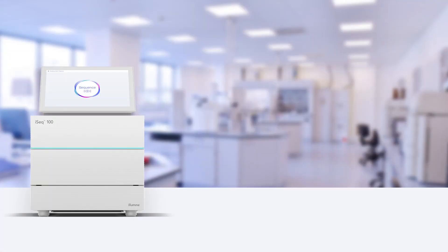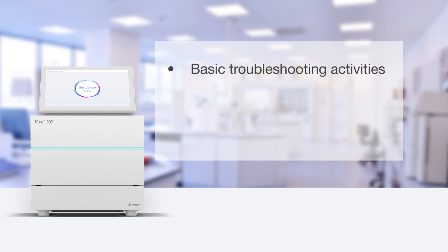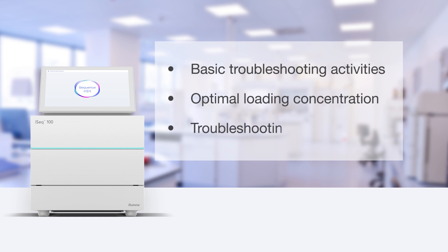Hello, Illumina community. I'm Tim Gilmartin, a Field Application Scientist at Illumina. The iSeq 100 system is Illumina's first user-installable sequencing system and is easy to get up and running. Once it is up and running, you'll want to keep it that way. Focusing on maintenance and run optimization can help ensure maximum uptime and productivity for your system. In this video, we will highlight basic maintenance and troubleshooting activities and resources, highlight optimal loading concentrations — one of the most common troubleshooting issues — and show you where to turn for additional support.